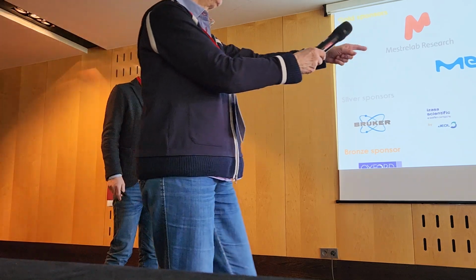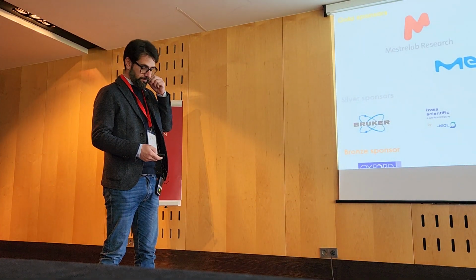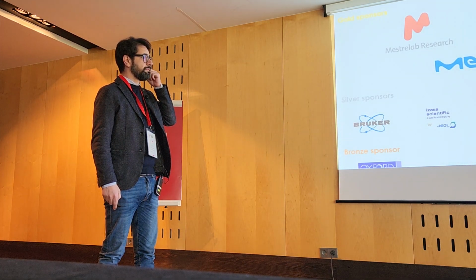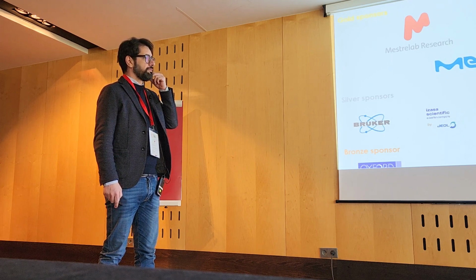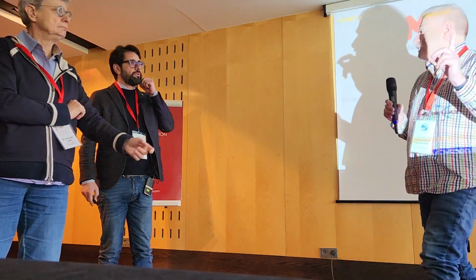Thank you. I have a question too. As you said on your last slide, the huge importance is getting proficiency in the user community to do the processing and later the acquisition. So the question is whether you think you can build proficiency to do fully manual analysis, or do you think that automated analysis has a role? Sorry, processing and analysis.